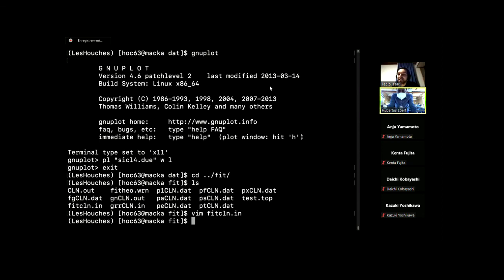And another question, it's very basic. It's concerning the structure file. This is a very simple system. So if we go for some complex system, is it possible to use some program and convert the CIF file to your input file, or can we just copy the atomic positions in the general input? There was a way to generate the input file using a CIF file, but I don't know if it's still available. I have to check.